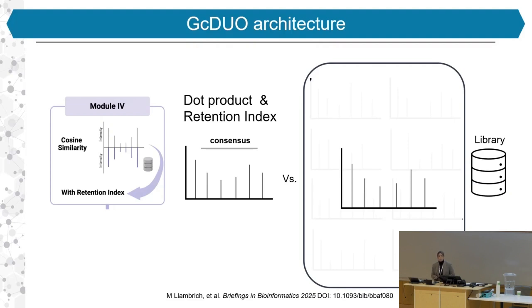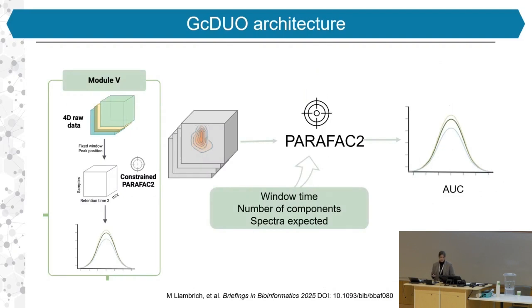From here, this is more or less the typical pipeline that we find in all the software, but we added an extra step, which is the refinement. Although we have obtained features with tentative identifications, the information is not accurate enough. The PARAFAC model can enhance the results when we introduce as many parameters as possible.